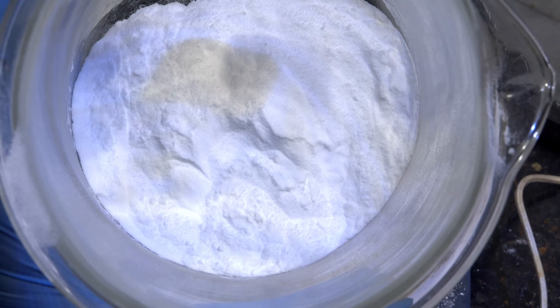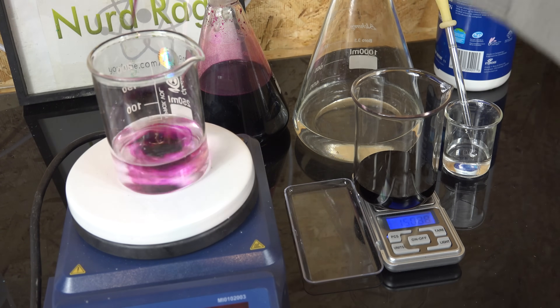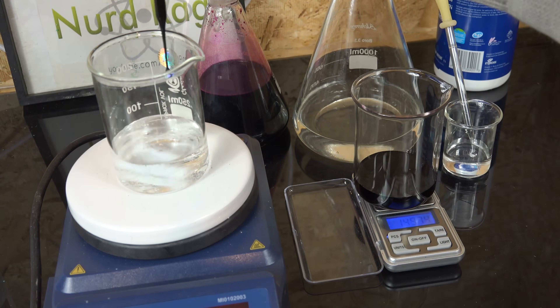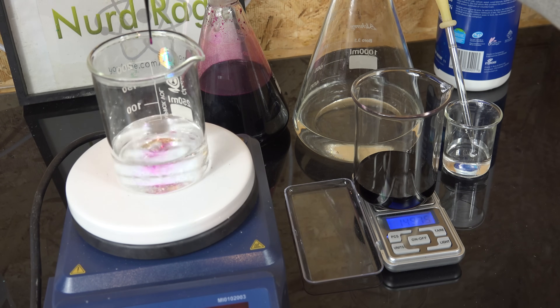Greetings fellow nerds. In this video we are going to make sodium oxalate, a useful chemical for redox titrations where we measure the concentrations of oxidants like hydrogen peroxide. I intend to use potassium permanganate as my titrant for hydrogen peroxide, but potassium permanganate is not very reliable due to variable purity. So another highly reliable standard chemical called the primary standard or analytical standard is used to standardize it. Sodium oxalate is an excellent primary standard for amateurs since it's easy to make and purify.